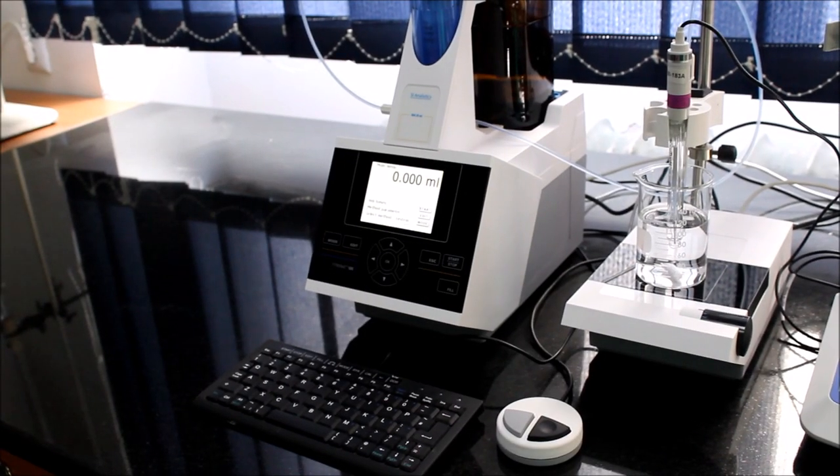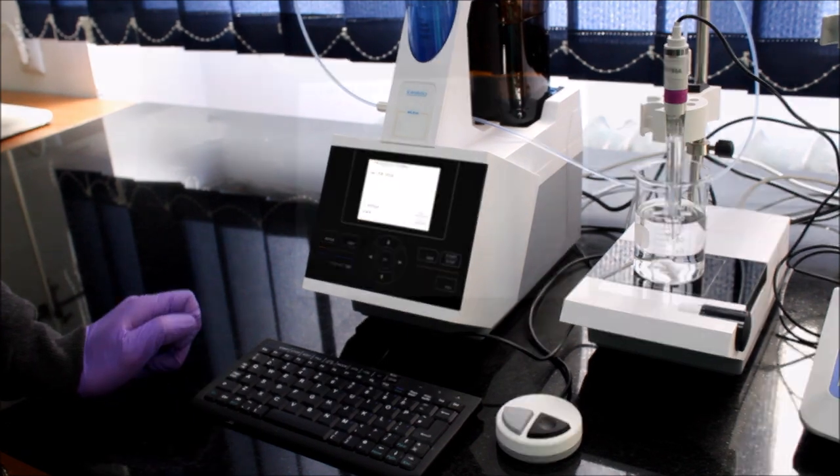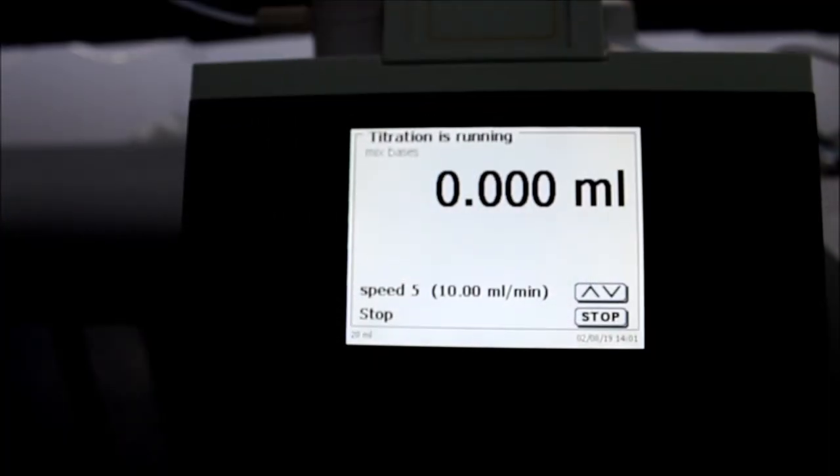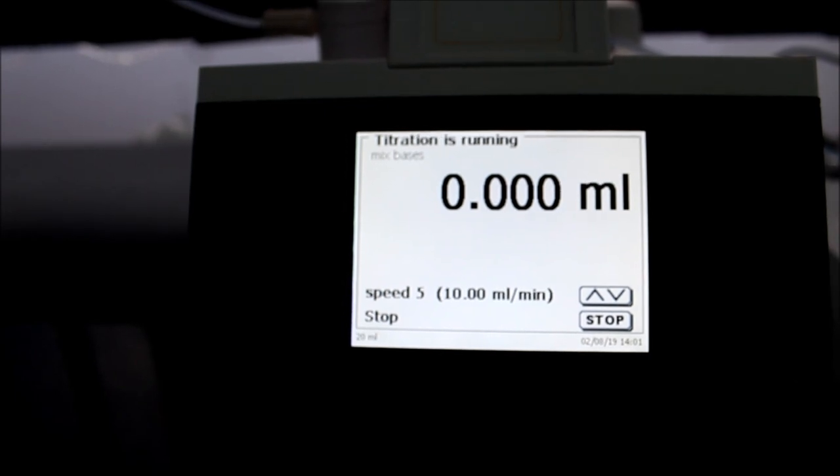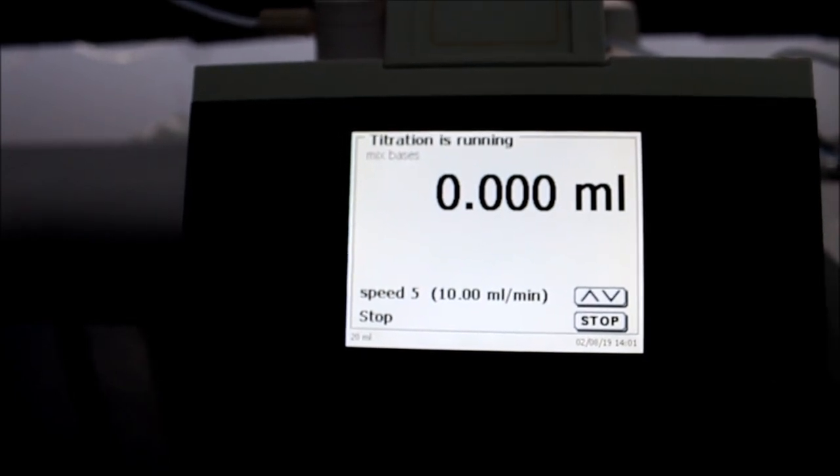To start the titration press the F1 button and then press enter twice to agree on the settings of titration. Now titration is running so you can start the titration process.